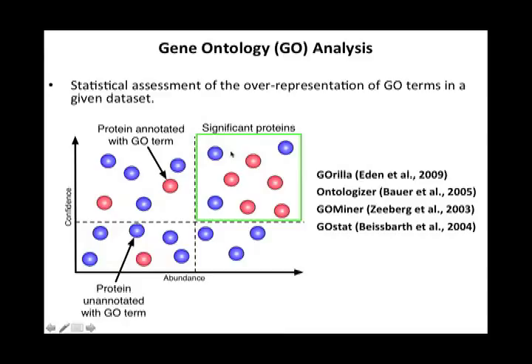And this is often done in the context, for instance, of proteomics or even mass spectrometry-based proteomics. This is often done by selecting somehow a set of significant proteins. So, for instance, proteins that are meeting certain abundance criteria or certain confidence criteria, and evaluating if among these significant proteins there is an enrichment for a certain molecular function or GO process. Basically, it asks if the proteins in red here that are annotated with a GO term are actually overrepresented in the set of significant proteins based on their overall representation in the entire data set.